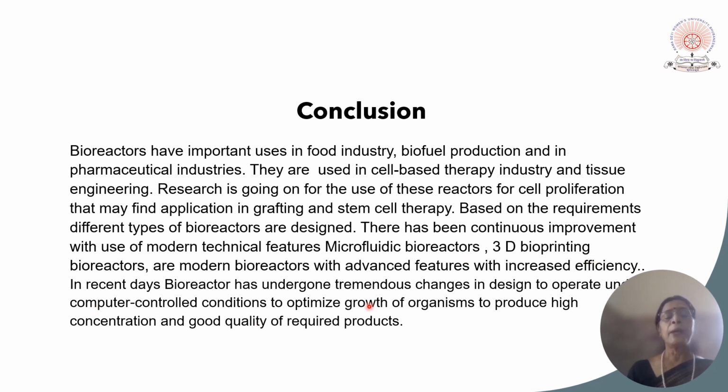So bioreactors were first produced during the 20th century, and in the past years, they have undergone tremendous change in design. Now they are fitted with computer-controlled conditions, and it is a high-tech device. In the future, it will undergo still more evolution because its applications are increasing day by day.